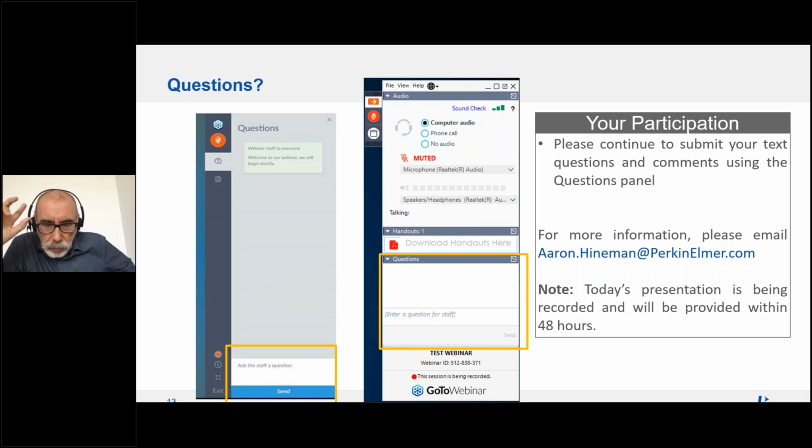And there was a second part. Sorry, I was just wondering if there would be interference from algae and bacteria in surface water. Okay. Well, no. We have checked it, and yes, you can think of a bacterium as a carbon-containing bioparticle.